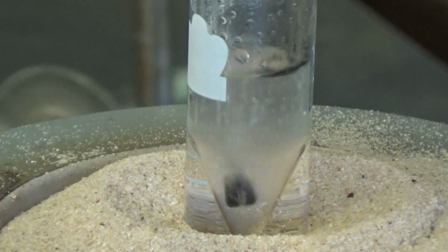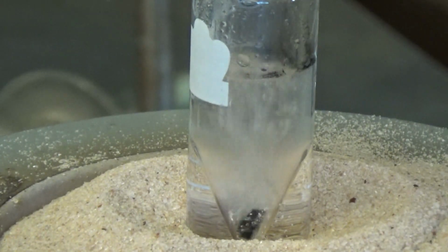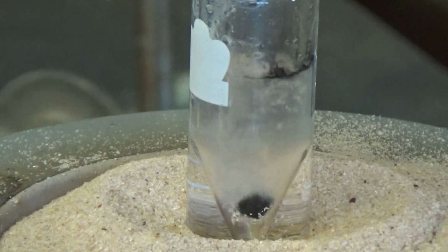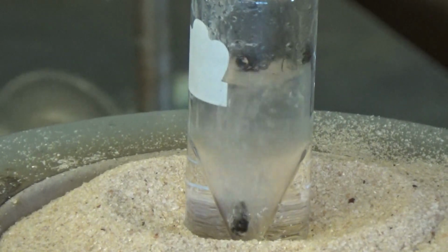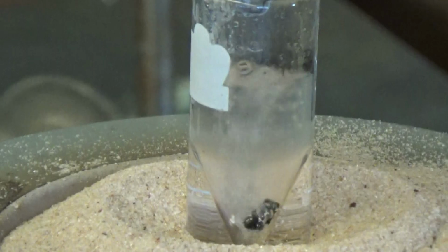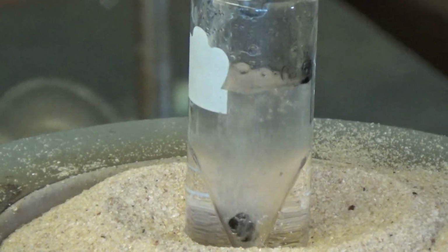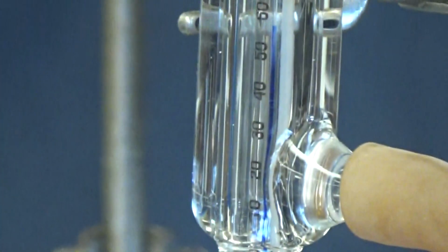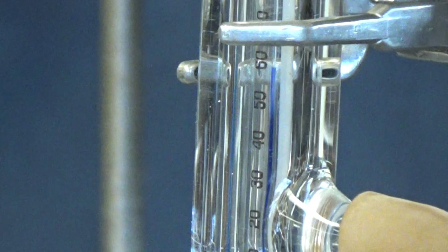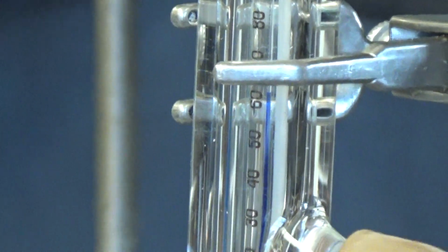Only problem we may have is that we are assuming that we have the right compound. The stock room has been known to mess up, so hopefully this isn't like dynamite or something. Trinitrotoluene. TNT. But so far no explosion, so that's good. It seems like it's boiling like crazy now. And eventually the product's going to boil up to the Hickman. And then we'll see the temperature rise also. What's the temperature at? The temperature is rising a bit. It's at 60 almost. It's climbing. Getting about 65.